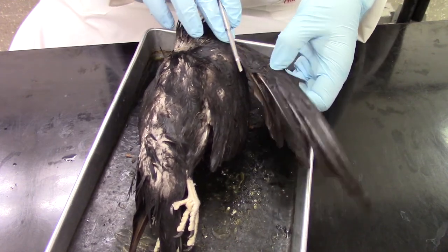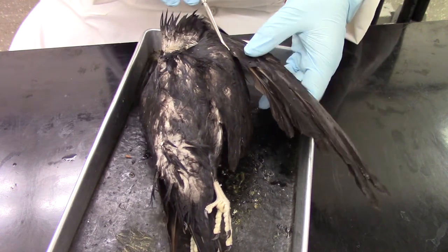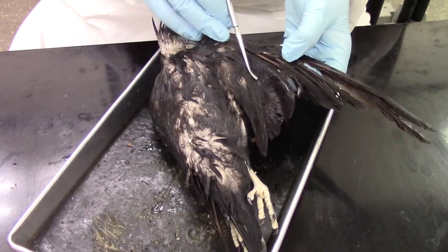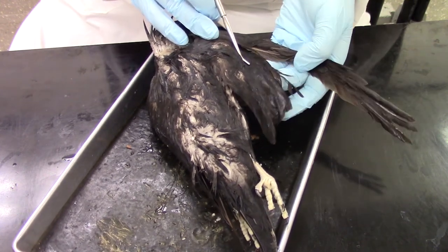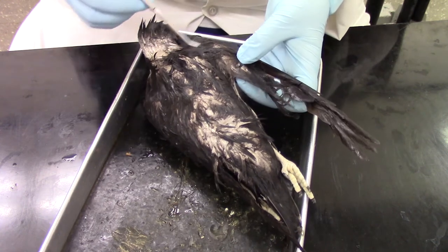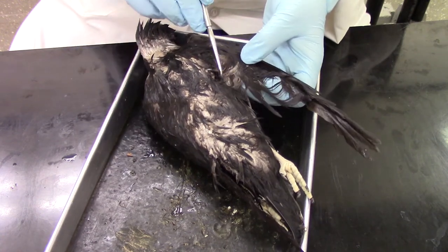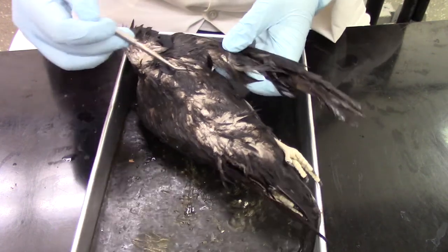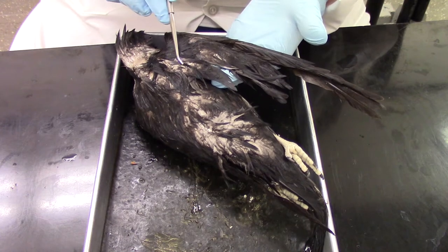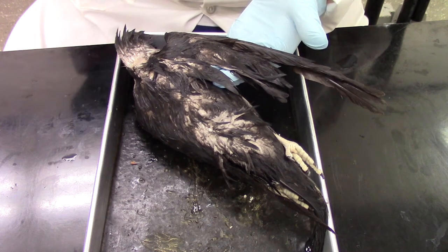The first set of feathers here are known as the primaries or primary flight feathers. The ones attached to the equivalent of the forearm are the secondaries — you can see they're much shorter than the primaries. If we get over to the equivalent of the upper arm where the humerus is, there we'll find our tertiary feathers or tertials. It can be a little hard to see when the bird is wet from the preserving fluid, but you'll be able to see the structures quite a bit better in class.